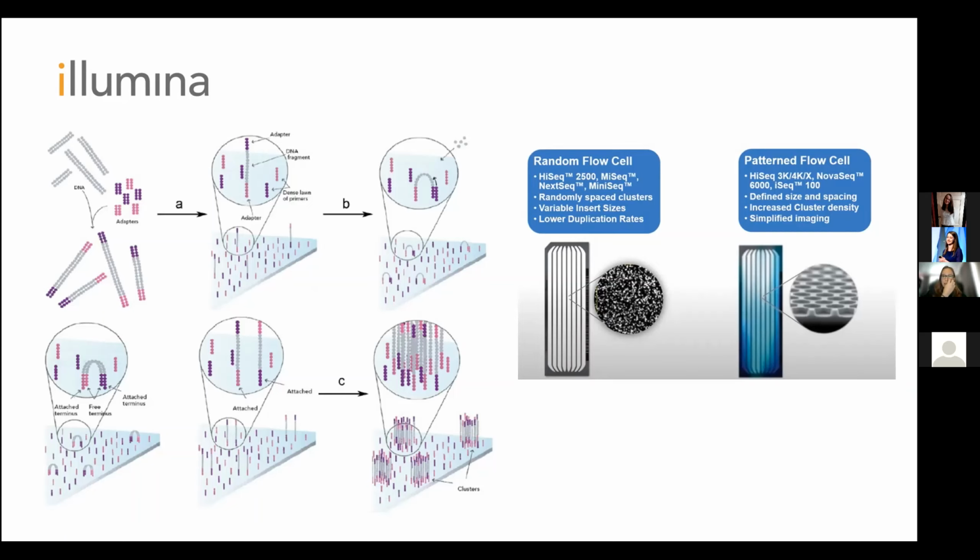After our DNA is attached to the flow cell, the polymerase synthesizes the complementary strand of the sample. Then the double-stranded molecule is denatured. The original strand is washed away. Then this newly synthesized strand folds and attaches with the other end to the other type of oligo on the flow cell, and the polymerase again makes the complementary strand.